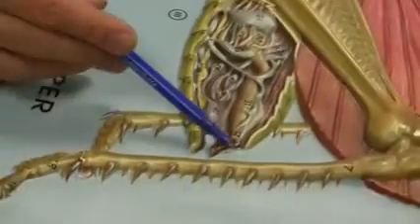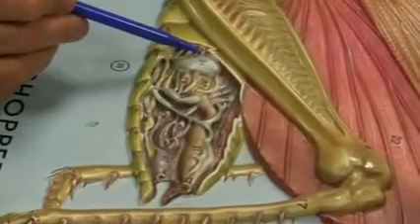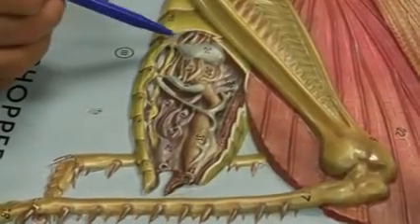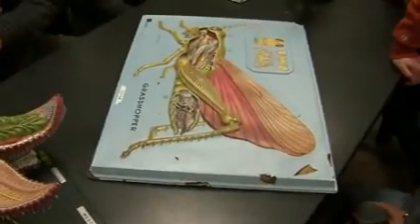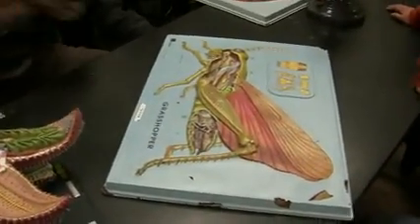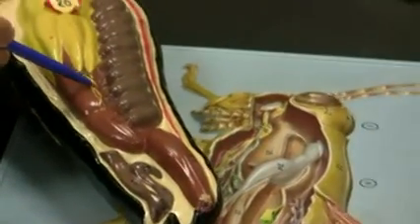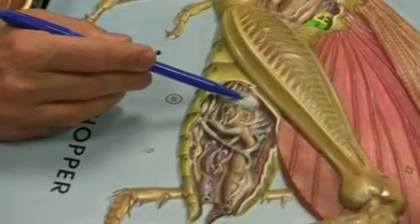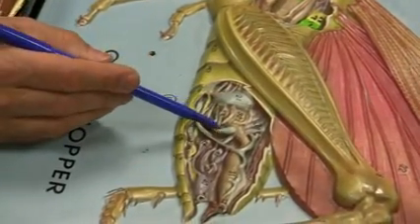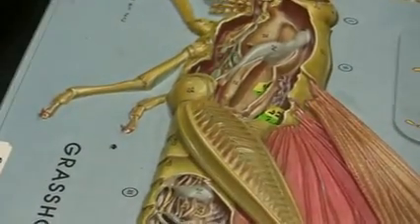This is again female, right? Ovipositor. And these hairy looking things are your Malpighian tubules. On the other one, I forgot to show it to you. Oops, sorry. Can I have the other one, model? I forgot to show you Malpighian tubules on this one. I have asked that, these hairy looking things. These are Malpighian tubules. Okay, so the Malpighian tubules would be here on this one. And these spiracles, this would be air tube or lungs, whatever you write down, I'll give you credit as long as you write lungs in here, huge air tubes, and so on and so forth.